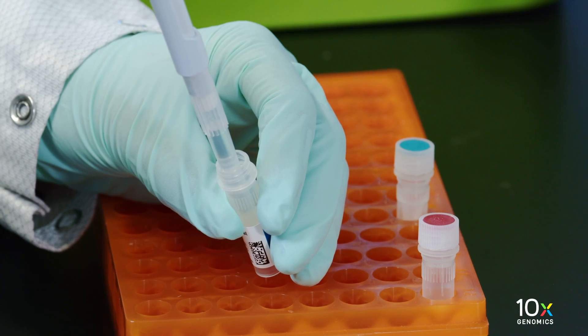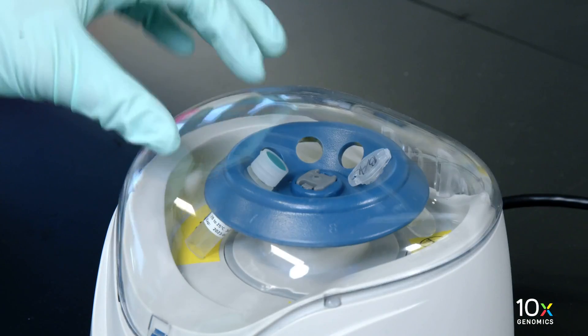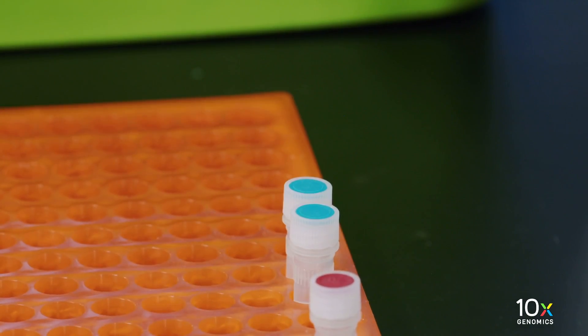Thaw the tissue removal enzyme at room temperature. Pipette mix, centrifuge briefly, and maintain at room temperature.